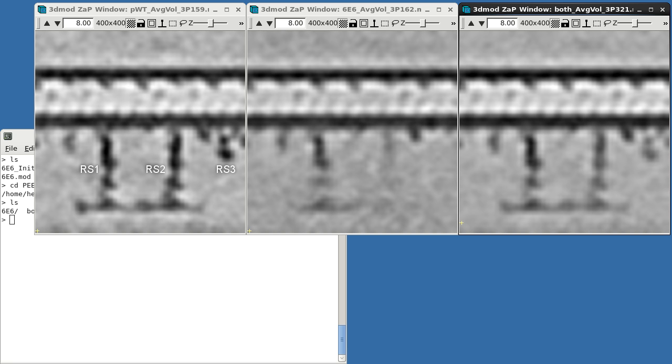In our artificial mixture, the resulting average appears very similar to the wild-type, with the main difference being loss of intensity in some structures. Loss of intensity like this can result from flexibility in a homogeneous structure or from a heterogeneous mixture of a small number of discrete configurations.